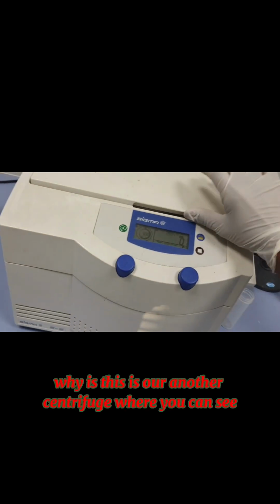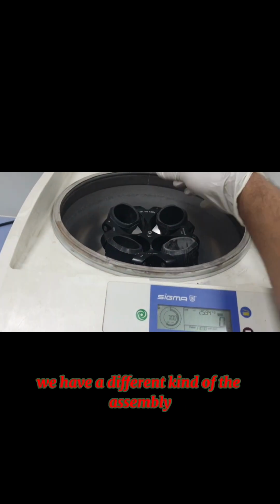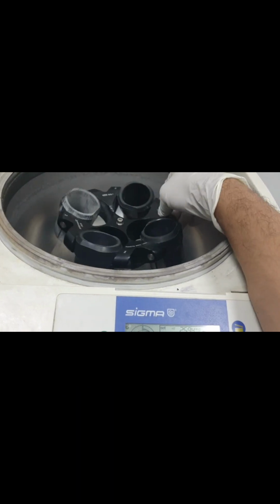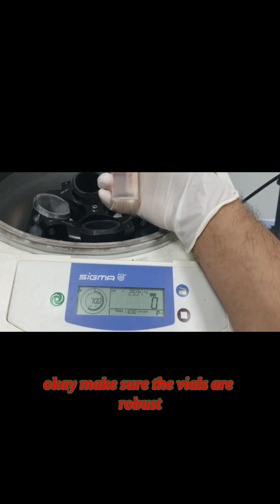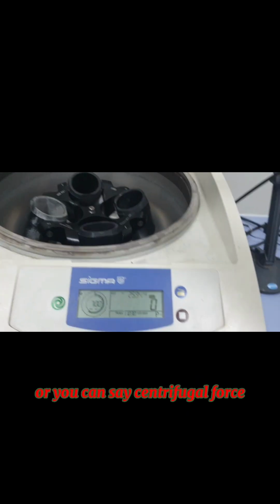Guys, this is our other centrifuge where you can see we have a different kind of assembly. This one is usually for these centrifuge vials. Make sure the vials are robust and can resist this much rotation, or you can say centrifugal force.